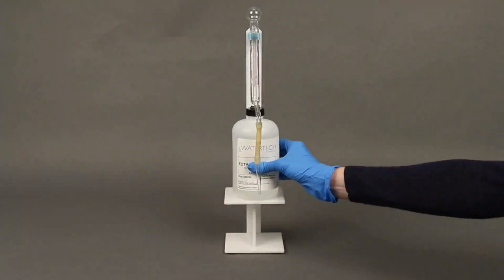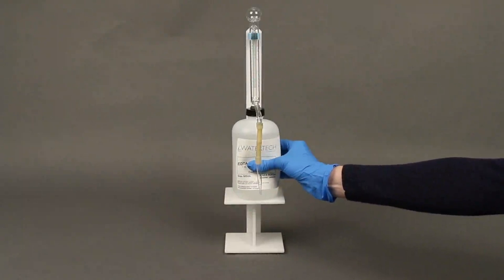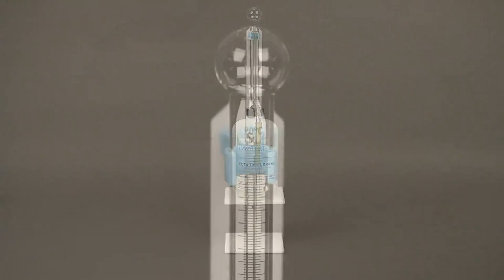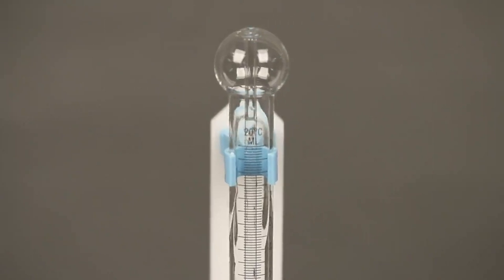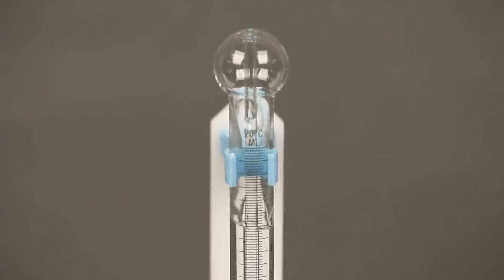Next, by squeezing the plastic bottle, force the hardness titrating solution to fill the burette to just above the zero mark. This allows the excess to drain automatically back into the plastic bottle reservoir.